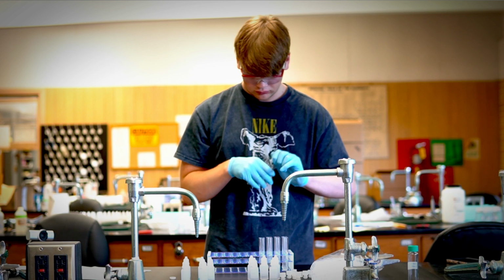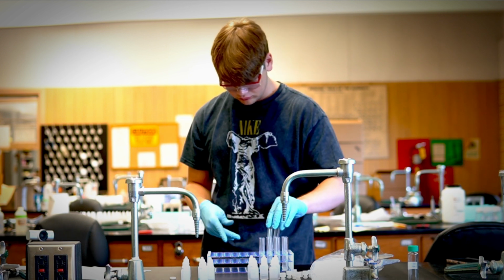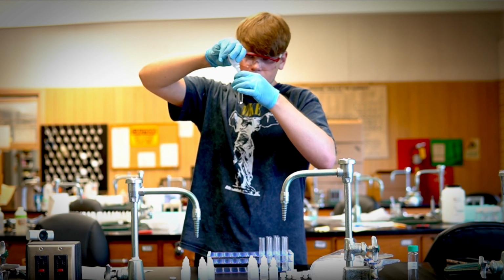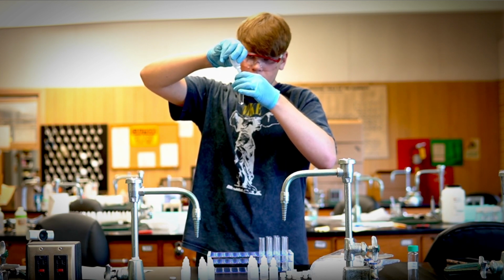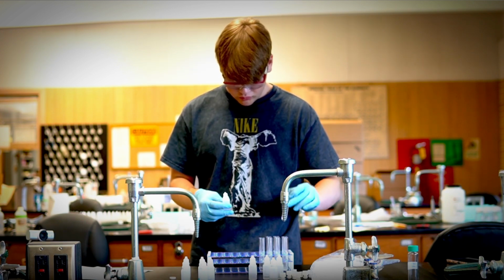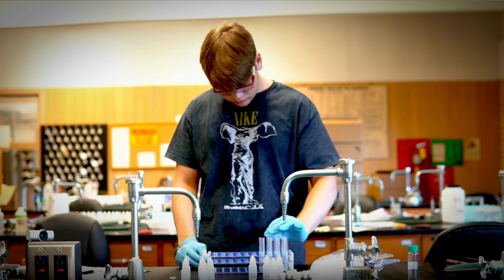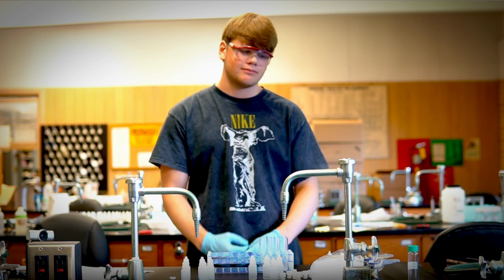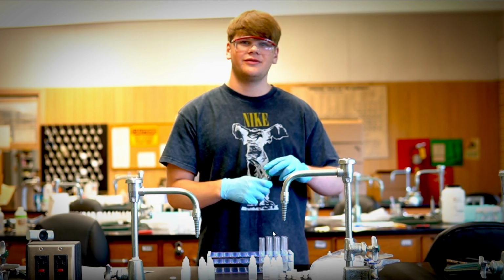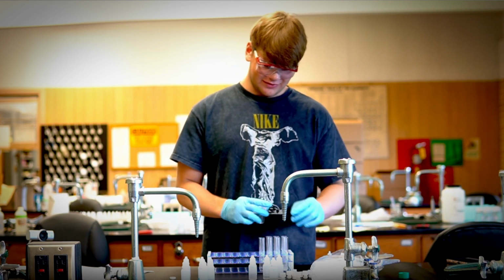So we're going to test three cations and two anions, but for each test, we're also going to have an unknown. So that's what we're doing here, and that's what we're testing here. And again, after you do all of the tests, what are we going to do? We are going to record our observations, and then we're going to put all our solutions into a waste beaker. So that is a waste beaker that we're going to be using, and you should have gotten it.